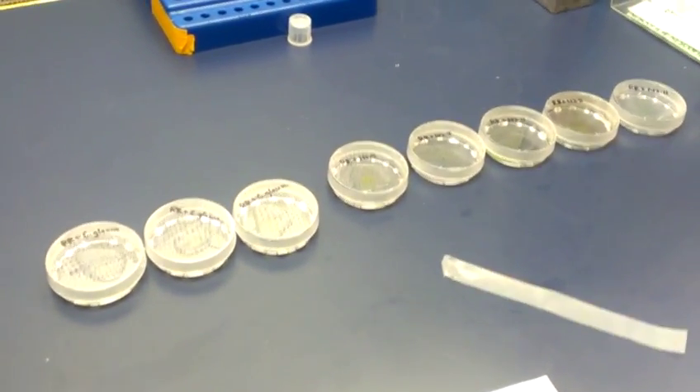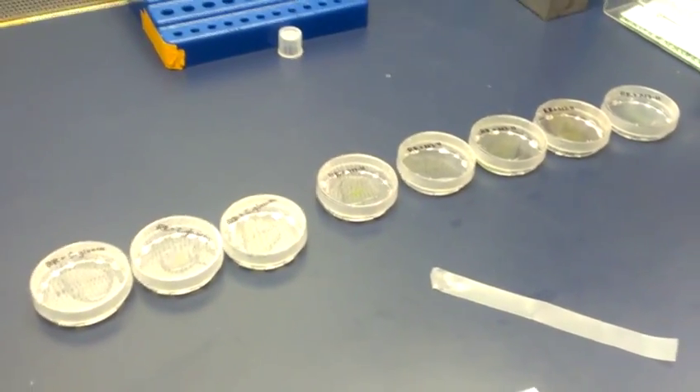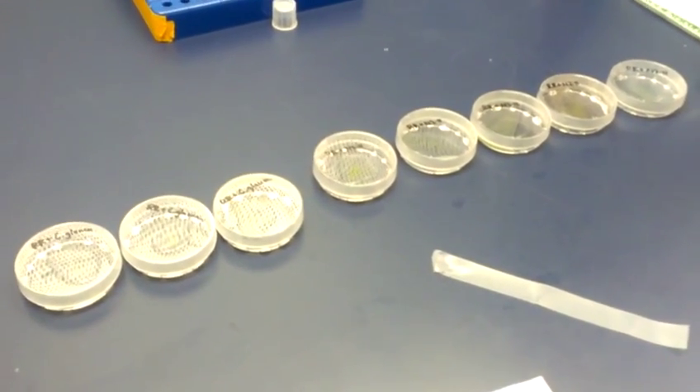Using a chemical called polyethylene glycol, I can fuse the two after stripping down their cell walls to naked cells called protoplasts.